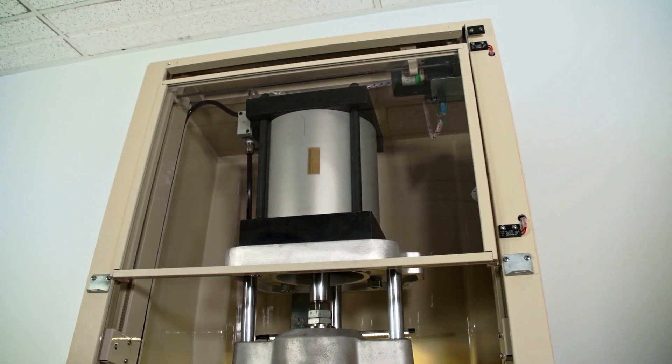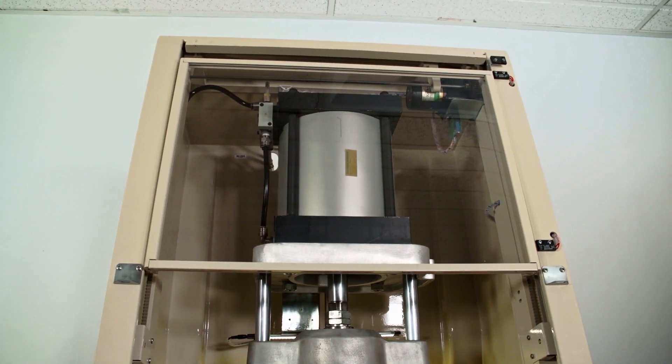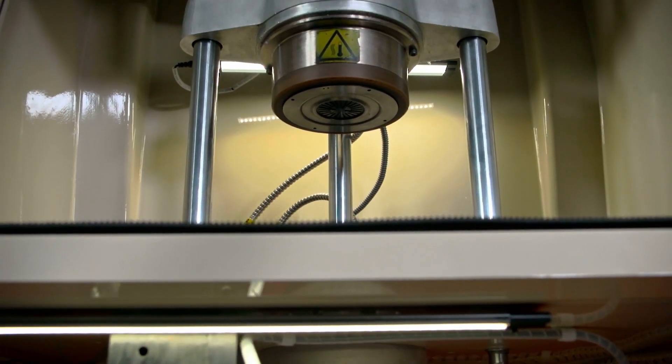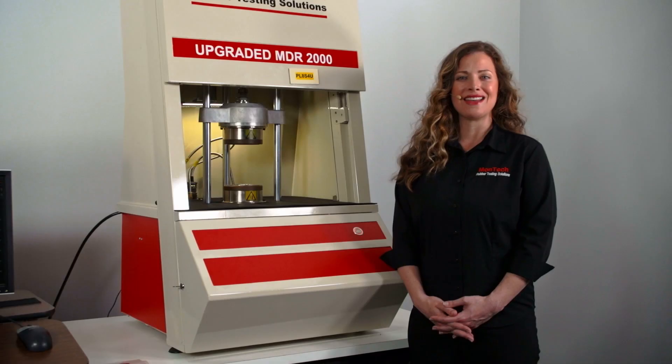The main cylinder is rebuilt, tested, and equipped with a new solenoid valve. The torque sensor assembly is tested to ensure linearity, repeatability, and hysteresis.